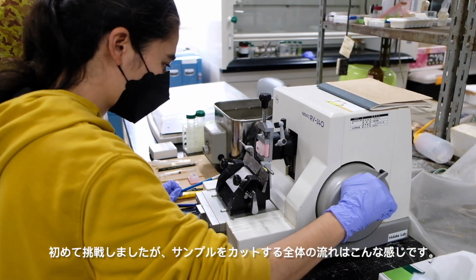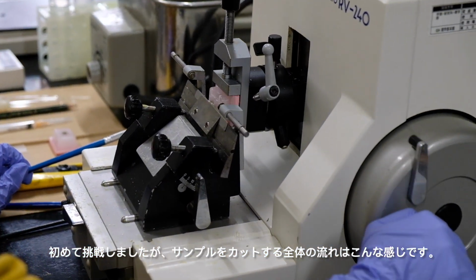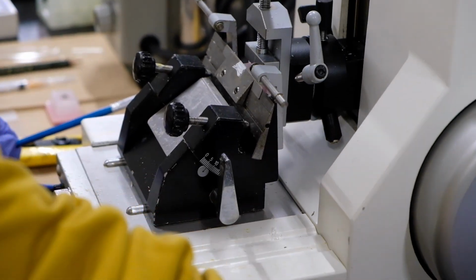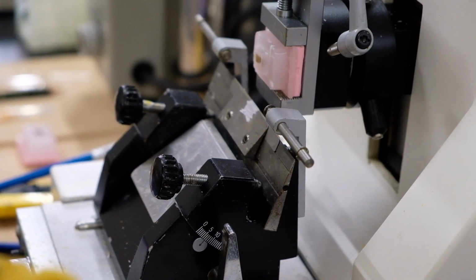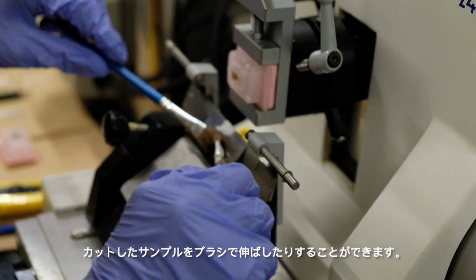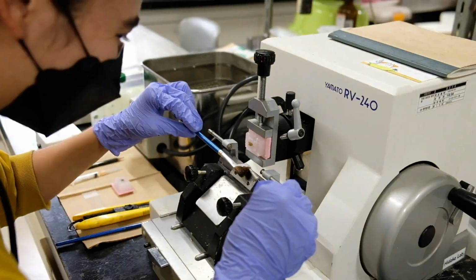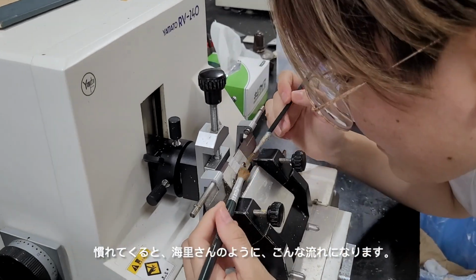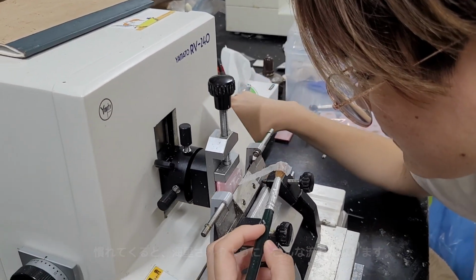This is the whole process of what cutting the tissues looks like. This was my first time, so take it from that perspective, but you can use the lever to cut the samples on the blade like so. And once you're done with that, you can use some brushes to elongate the portion that has been cut and put that into the water bath. This is Kairi-san, who's also showing us how to do it, especially once you get more used to it and can do it faster.